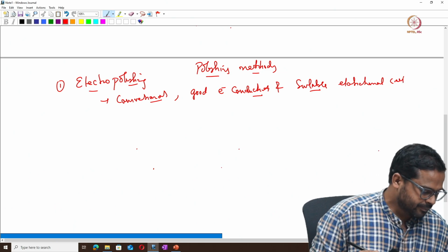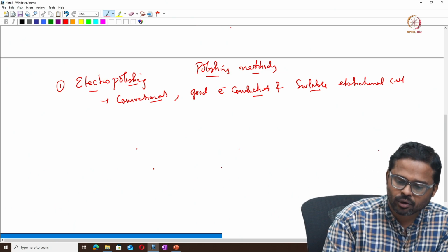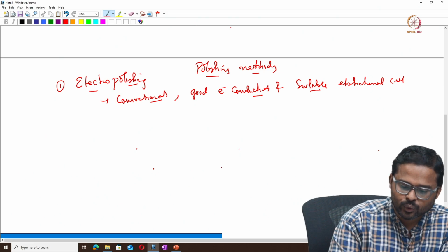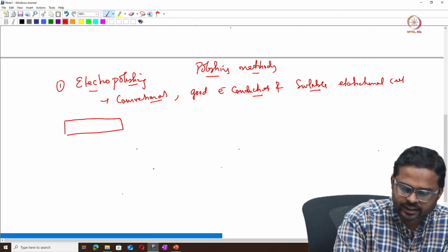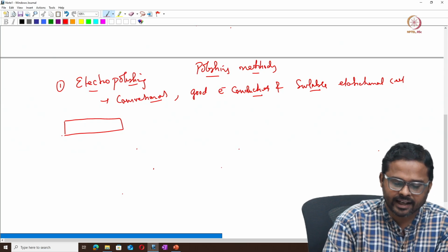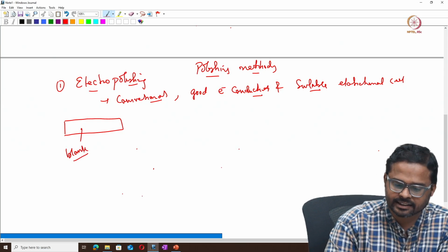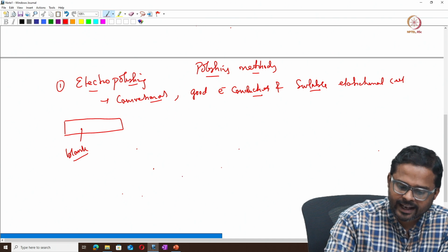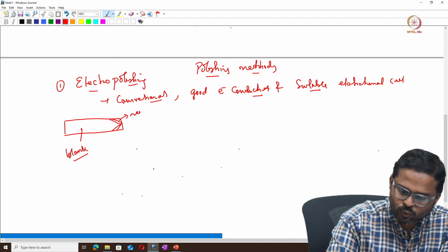Okay, and so this electropolishing, it is nothing but you have rectangular blanks, this we call as blanks of some mm size. Then by electropolishing, actually you can thin down this specimen to a needle specimen by removal of this material.